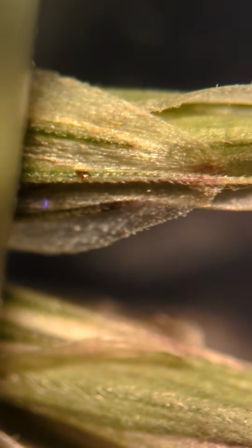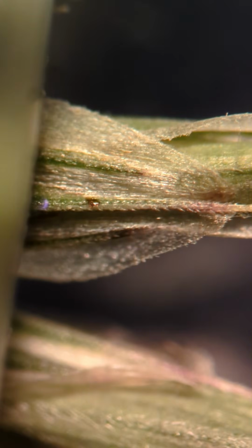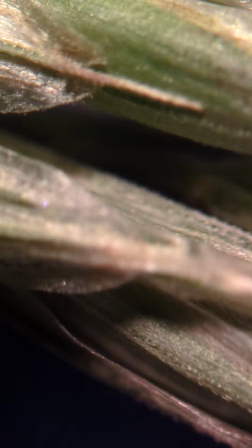However, some grasses have been bred so that they don't shoot their seeds everywhere because they need to be easier to harvest. So this looks like corn, yes? Yes. All right. So we have bred some grasses so that they don't do the things that they need to do to be all difficult and spread their stuff everywhere. Anyway, it looks like corn, yep.